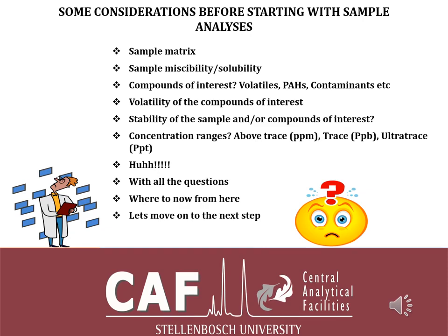Also, the volatility of your compounds of interest. How volatile are your compounds of interest? Why is that important? It is important because if your compounds of interest are very volatile, you might find that you have to keep them at a cooler temperature so as not to lose your compounds of interest because of their volatility. Or maybe also the stability of your sample. If your sample is very unstable, you might have to keep it in a cooler condition, or do your preparation in a cooler environment.